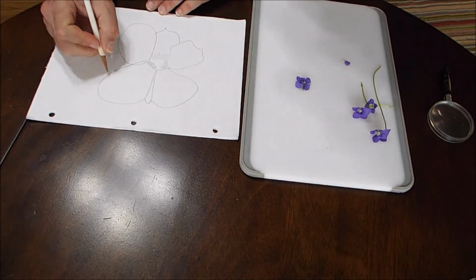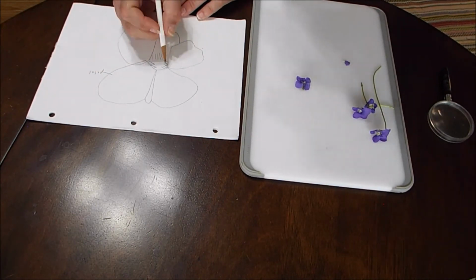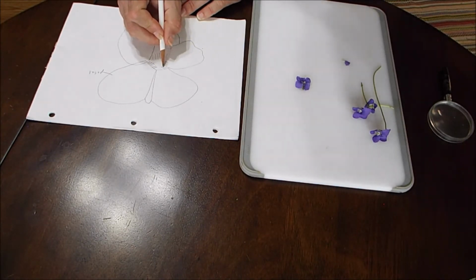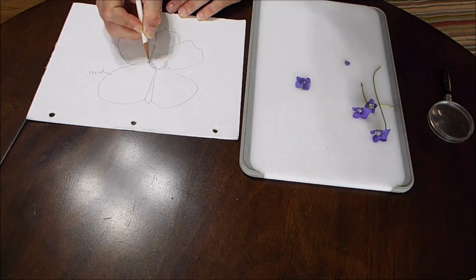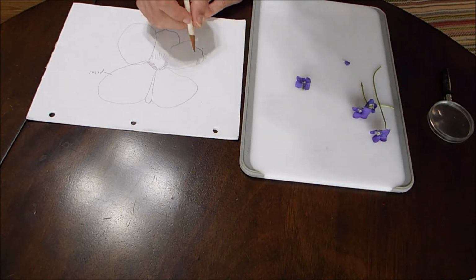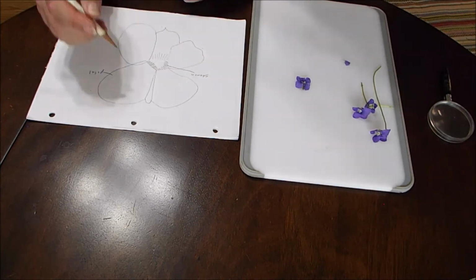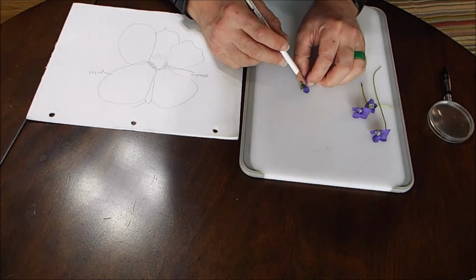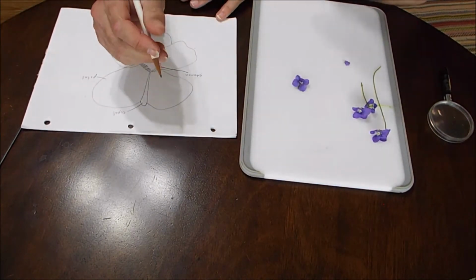So again, petal, only have to label one really. And just to move things around, I'm going to do, really there's a lot more of these fuzzy things, but it'll get pretty cluttered if I fill it in too much. And draw a line to a line, that's tricky. I'm going to go like that. Stamen. Alright, and then this, sticking out the back, is actually part of the carpel. Or is it? Let me take a look. No, it's really the rear end of a sepal. So we're going to call that sepal. And we're going to put all the same stuff on it.